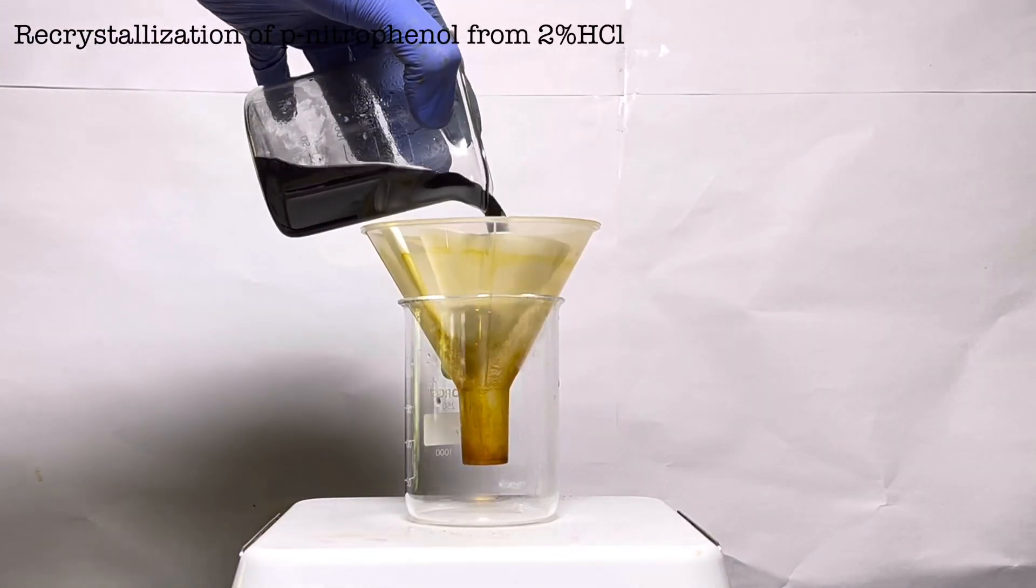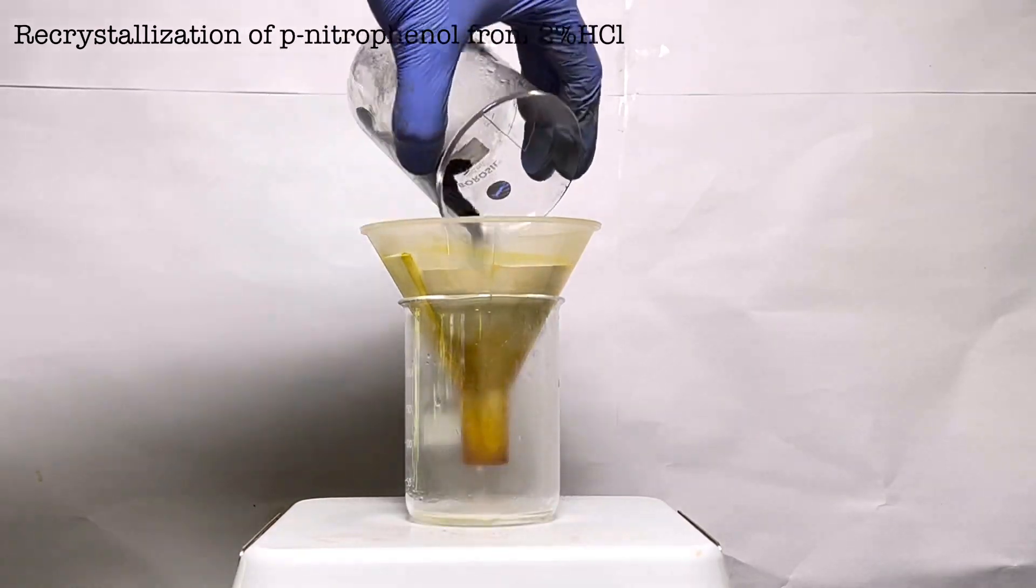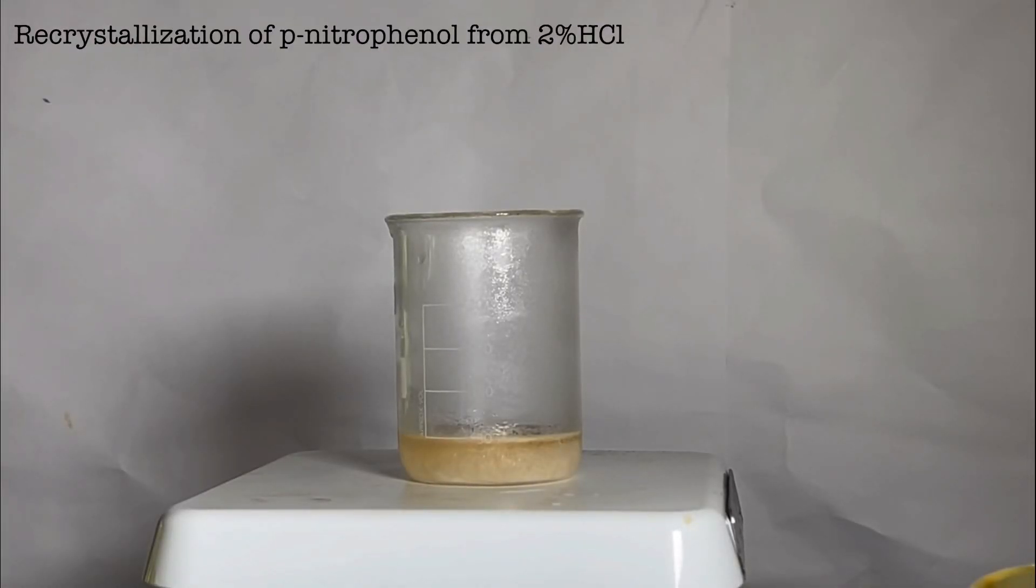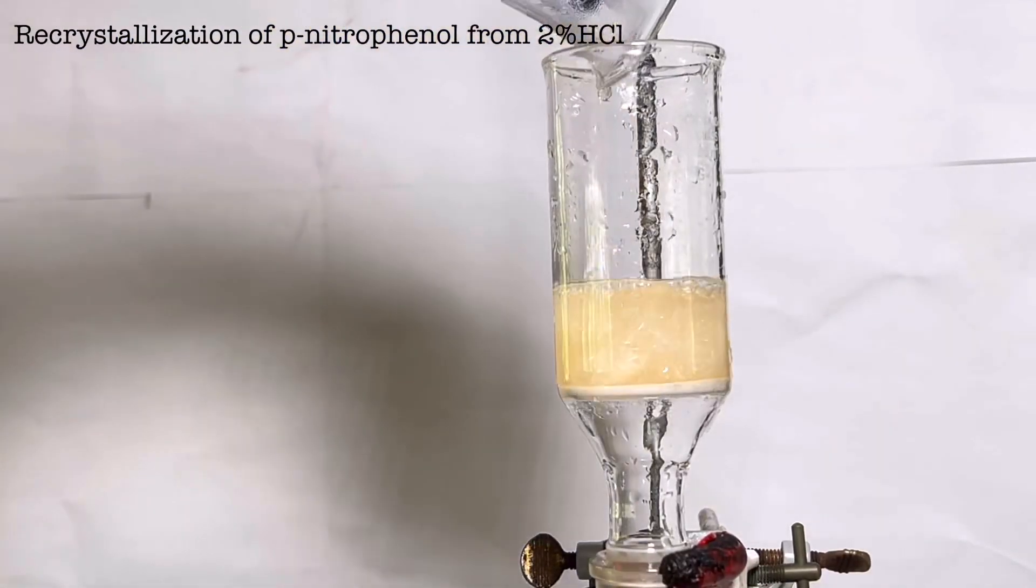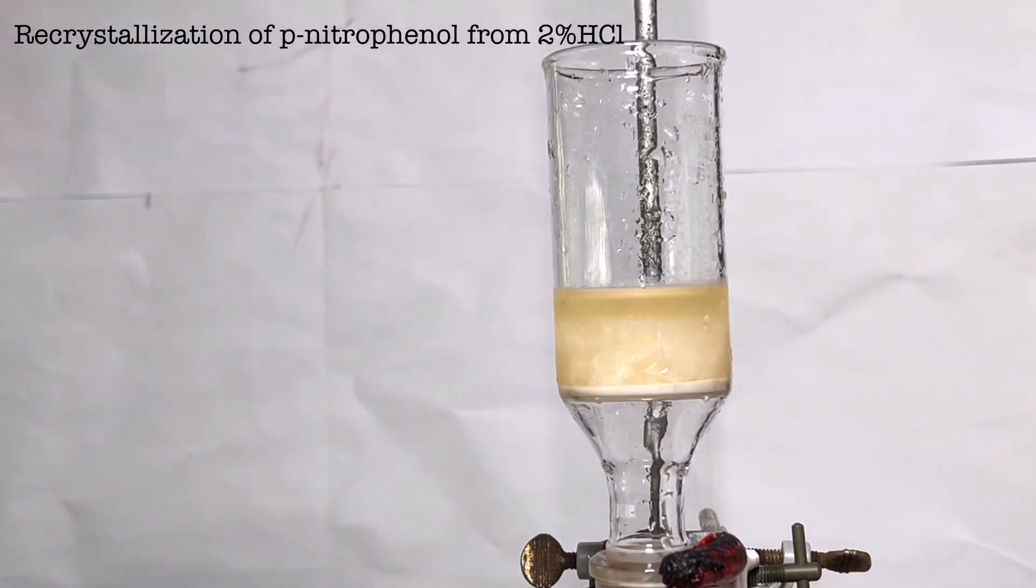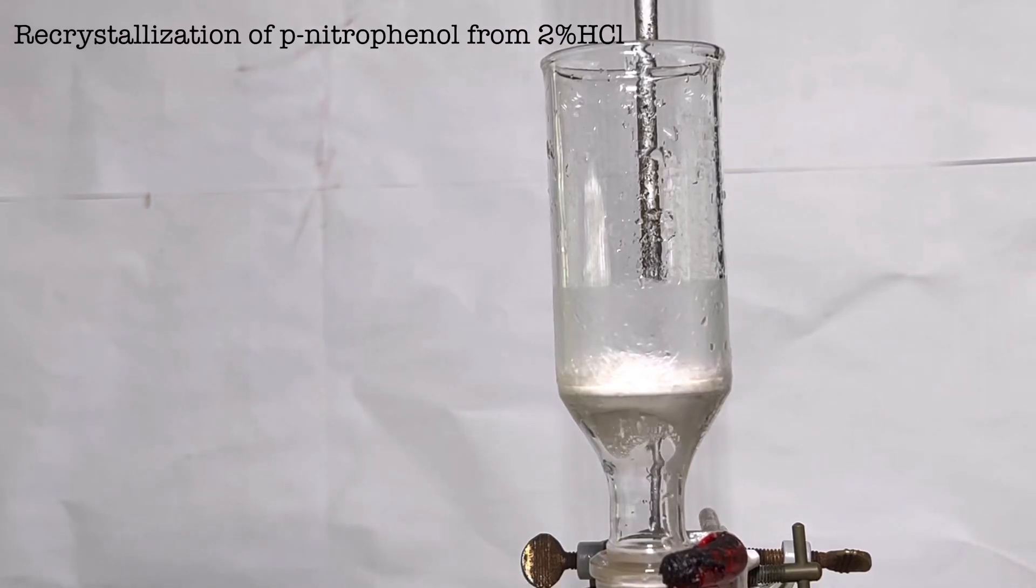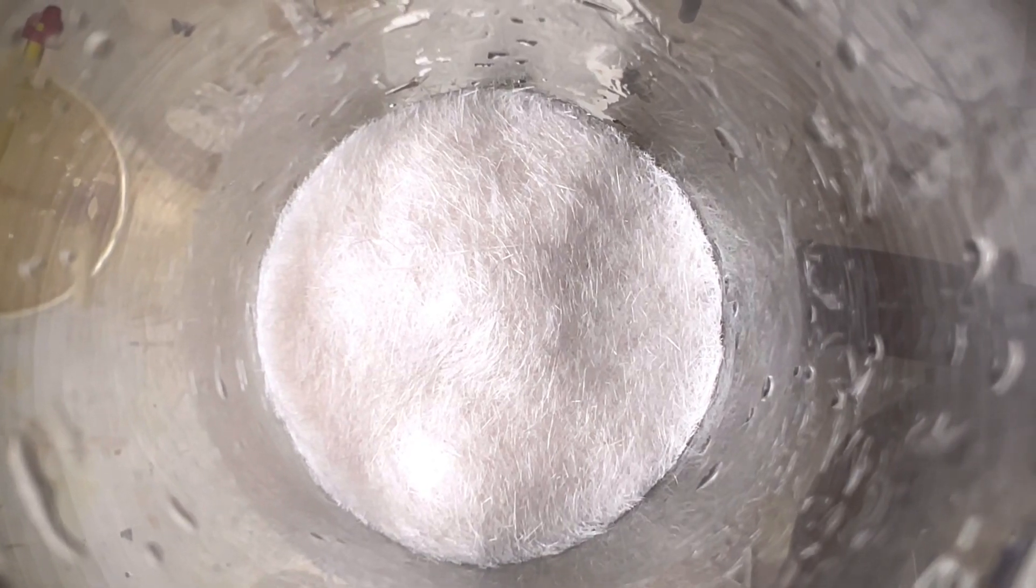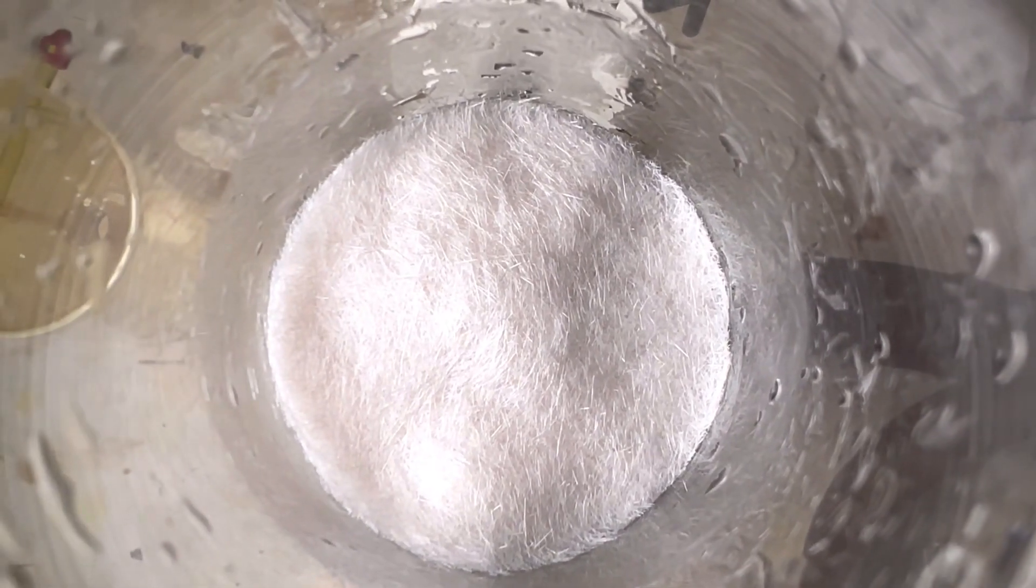The filtrate was much purer. It was put inside the fridge for a few hours. Then the crystals formed were filtered. Now we have much purer white crystals. It was scraped from the funnel and transferred to a bottle.